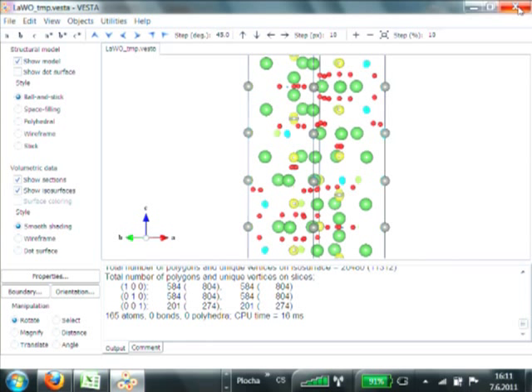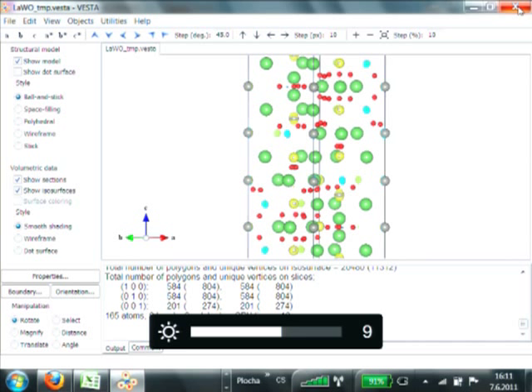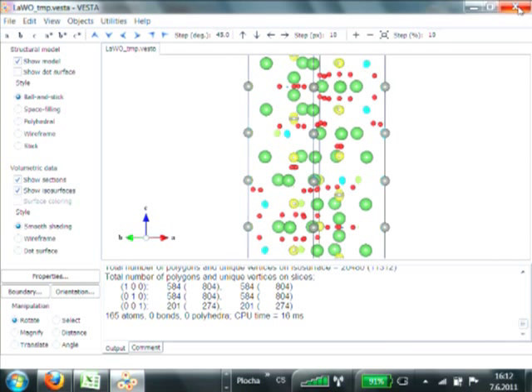Hi, Paul from Sheffield here. If you don't have high resolution data, but you do have heavy atoms, will you find the location of those heavy atoms? High resolution data depends on your structures. What is high resolution for an organic structure can be low resolution for a heavy atom structure. So I think this would work if you cut your data at 2 angstrom. That would almost certainly work, and probably it would work even at much lower resolution.